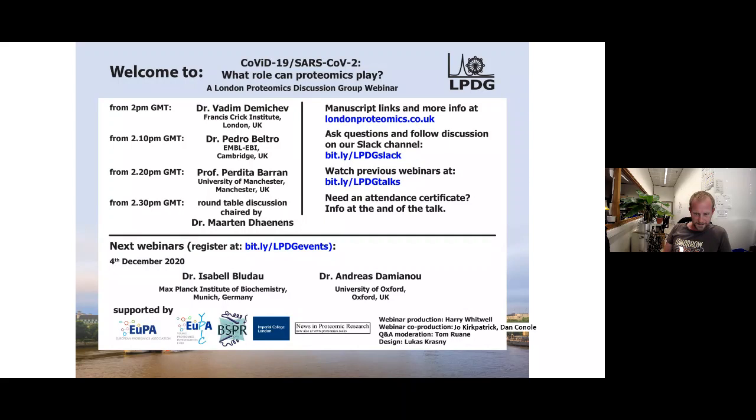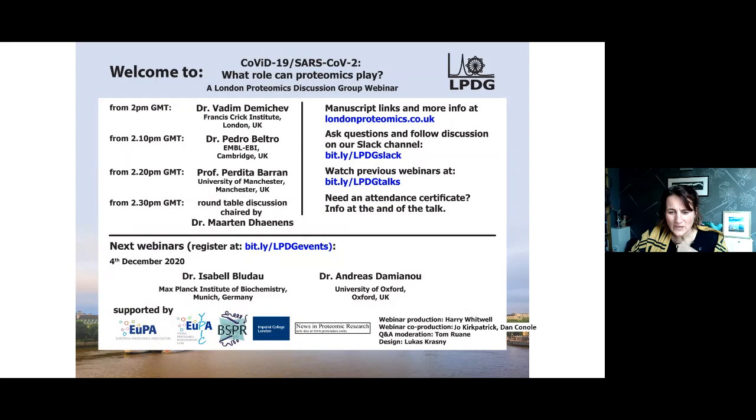So I think one of the areas, and this is in a way what Pedro talked about, is in HDX mass spectrometry to try and map the interactions, and particularly with mutated forms, and to map those dynamics around the interactions. And I know Weston Strew and others have been working in that area, and indeed it's something in our own lab we'd quite like to get onto. So I think that's one of the areas it can help, but clearly it can also help in determining the host response following vaccination. And I guess that will be an interesting thing to do, particularly in the trials where people are going to be infected.